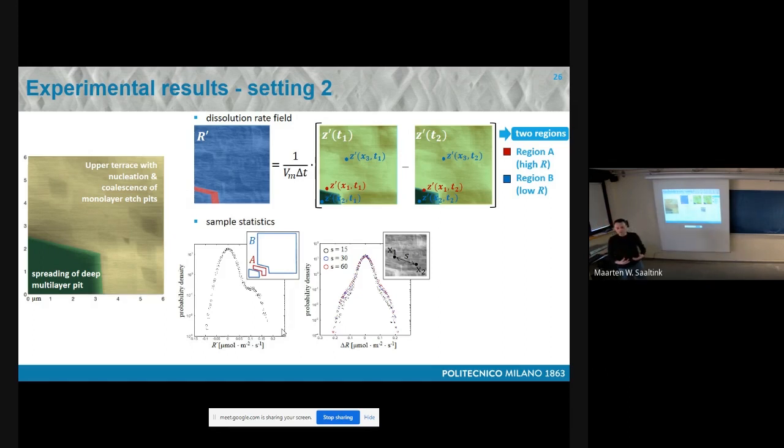If you then take this map, you come up with a sample probability distribution of the data, and in this case you have two regions with a bimodal distribution. Okay? Usual enough, I would say, something like this. Usual, I mean, not normal distribution, sorry. Then, of course, we also want to characterize this distribution so that it is compatible with the probability distribution of the increments associated with given lags. So you can construct increments associated with given lags.